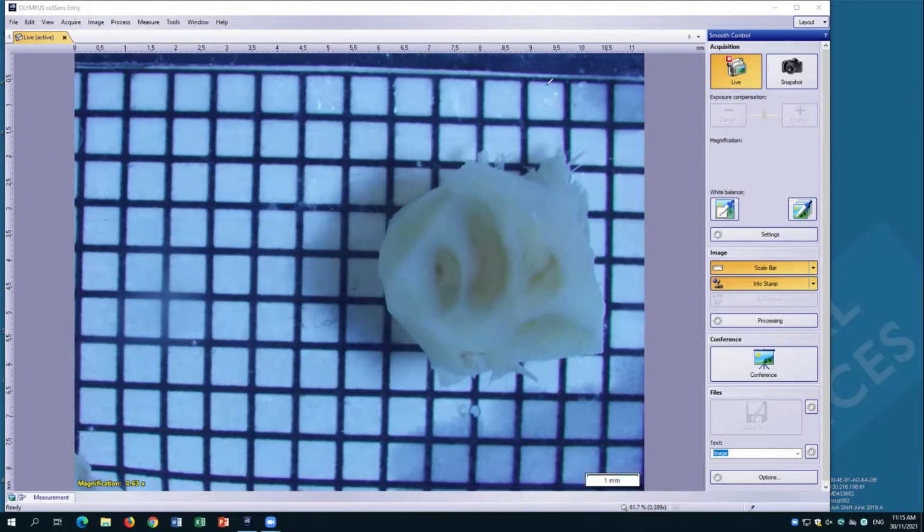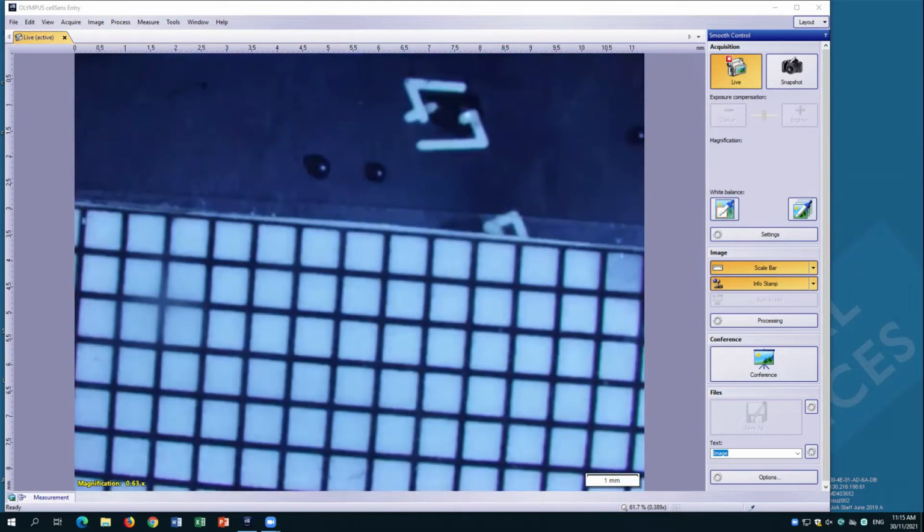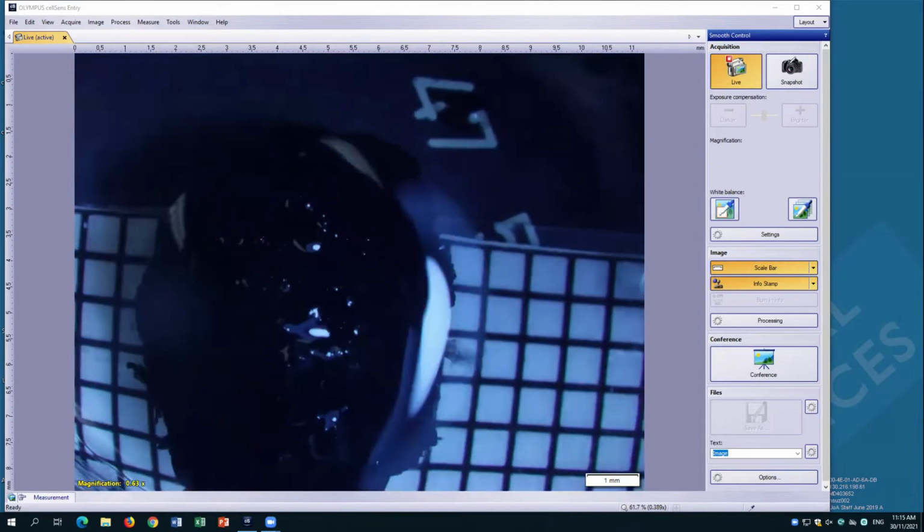And if we want to look at the cochlea, we'll trim away, centralizing the cochlea. If we want to look at the round window, we'll trim it right down to the round window. So tissue preparation is a lot of hard work. And from here, for micro CT, we get something like this.